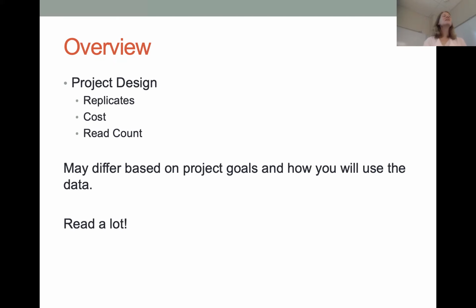So when you're looking at that many samples, you've got to scale up to HiSeq or NovaSeq for it to be affordable. MiSeq is great if you're doing a de novo transcriptome, I will say that, but it's for some applications. If you're just trying to get a lot of reads for really cheap, it is not cost effective.